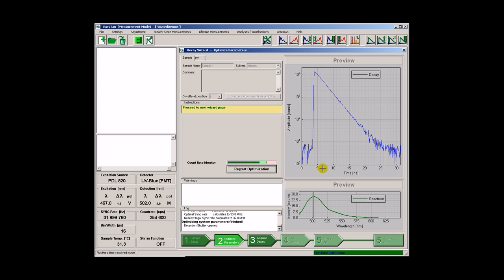The task is now finished. The decay curve fits nicely into the available time range, determined by the highest possible repetition rate which is applicable for this sample. The detection count rate is adjusted to be roughly 1% of the repetition rate.